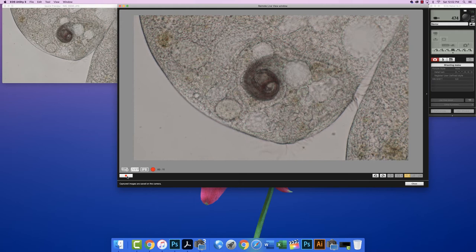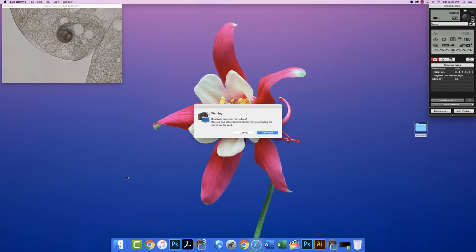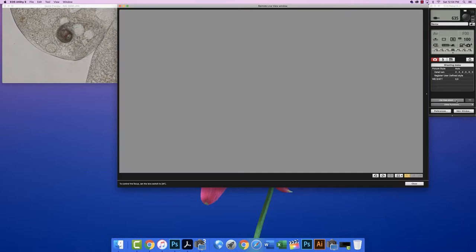Okay, I'm going to stop there. I'm going to switch back over and take a couple more still images. I got the warning again. I'm going to cancel that. Reopen live view.